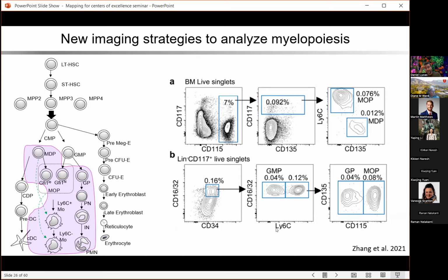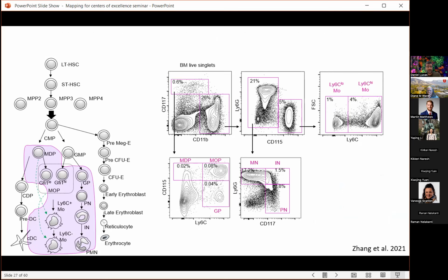So what Jiyu, Jan, and Qingqing Gu, who led this project, did was very carefully develop new stains that allowed us to interrogate these populations of interest. And in here, we are showing you the populations that we detect using only 5 fluorescent channels.